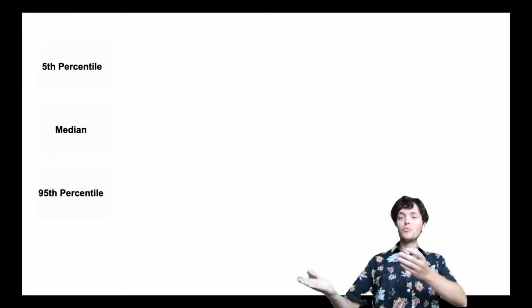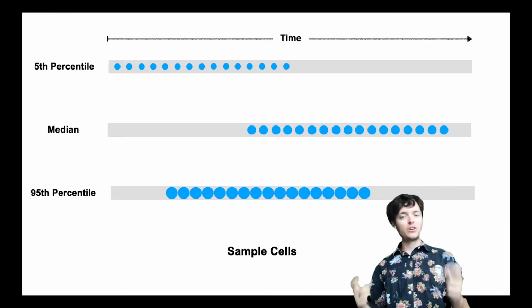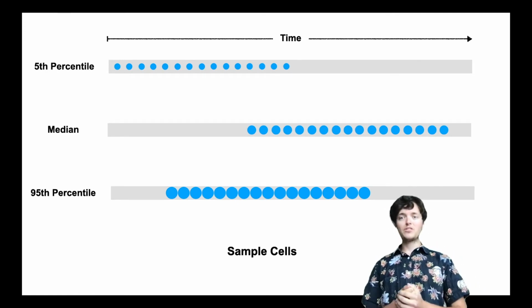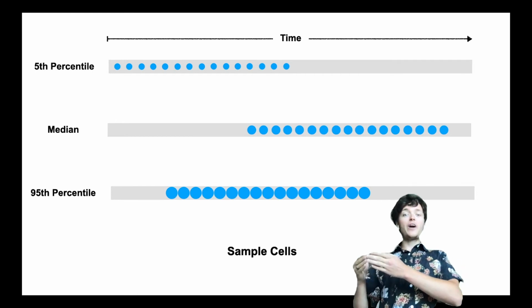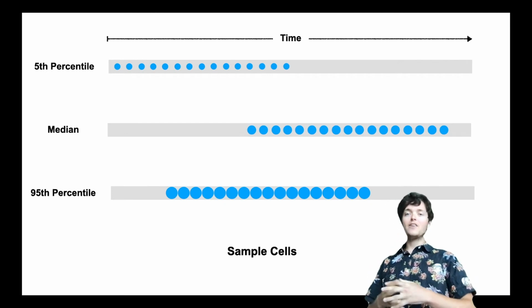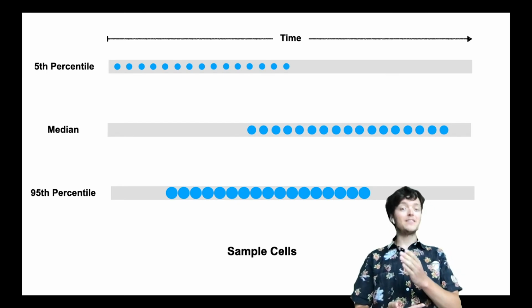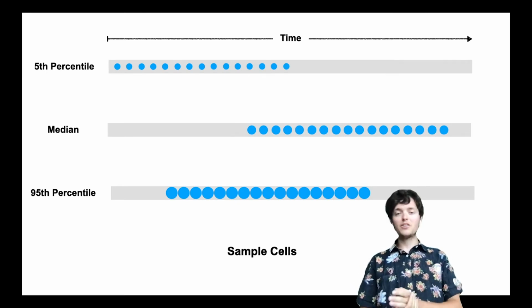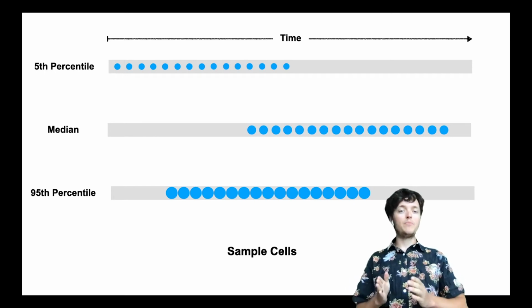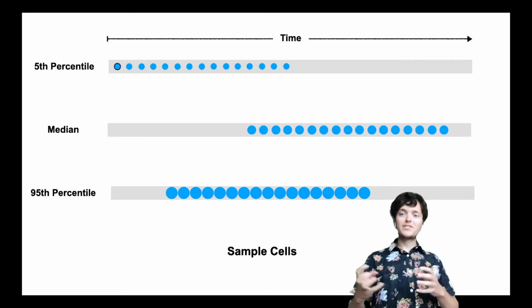But moving forward with this selection, you can then display these tracks and align them strictly by time. And this is something that we did as a first attempt within our tool, but it turns out these tracks can become very, very long for medium to long experiments. And also for our data, since images are taken at the same location every 5 minutes to maybe every 30 minutes, the cells do not change significantly within the span of one frame or even several. So we decided to do temporal sampling of these cells.